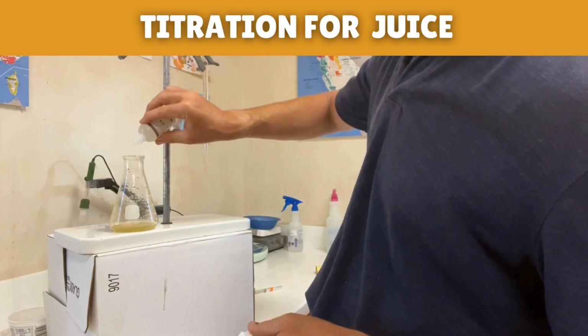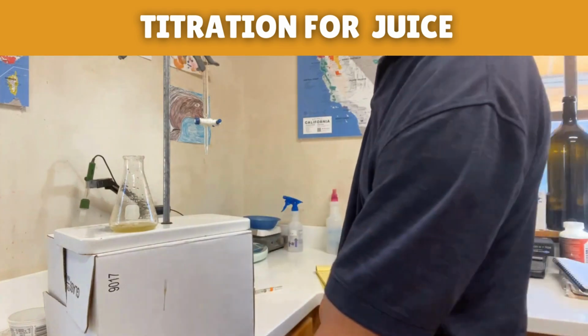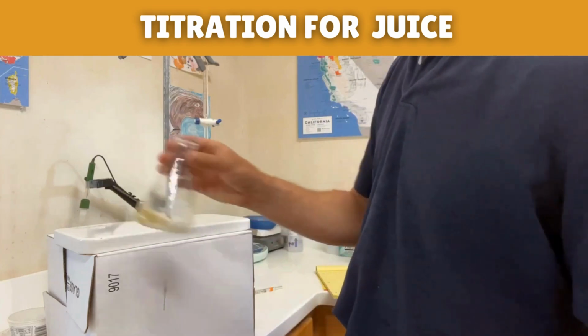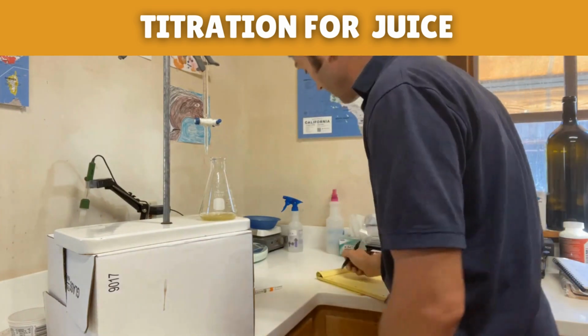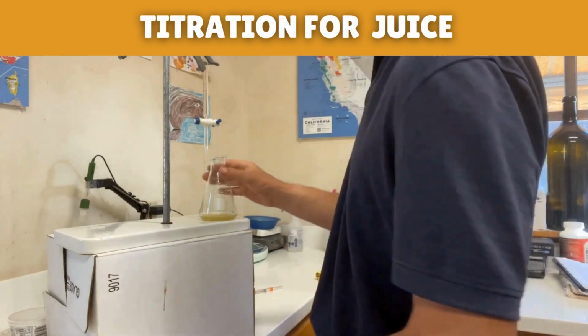It's going to turn pink. At pH 8.2, that's the endpoint. I know from prior measurements this juice is starting at a pH of about 2.9, quite acidic. Okay, so we'll come up here to the burette, and we are starting at 10.5 milliliters. Make sure to write that down. That's the one thing I mess up most, forgetting to write that down.